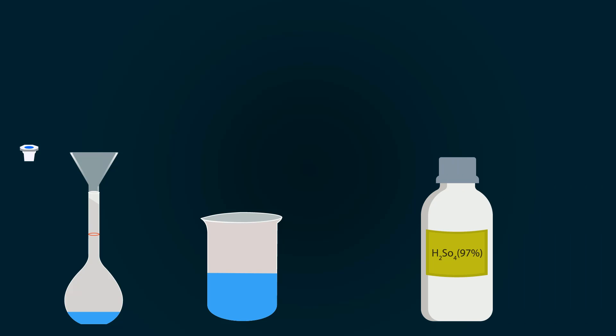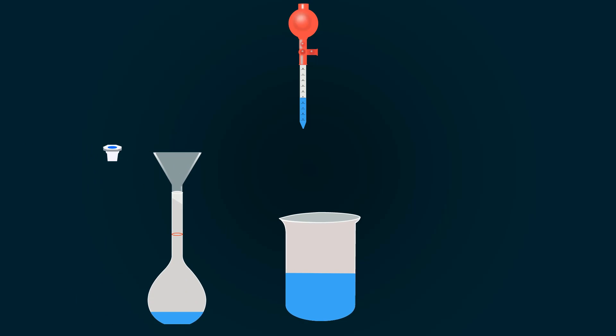Now take the bottle of 97% H₂SO₄, open it up, and pipette it out up to our required volume. Now put this into the measuring flask.